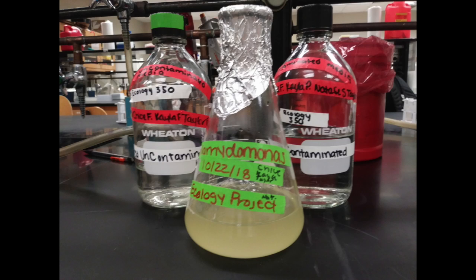The purpose of our experiment was to examine the effects of mercury exposure on Chlamydomonas cell density growth, providing implications for the impact of toxin exposure on predator-prey dynamics in the environment. We hypothesized that the mercury-contaminated water would have a negative effect on Chlamydomonas cell density growth.